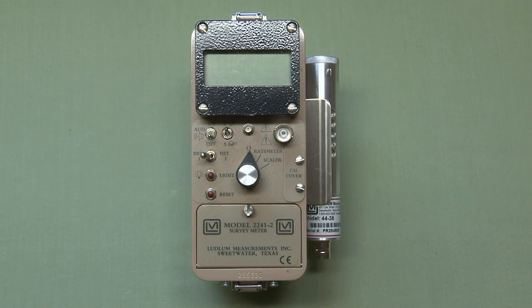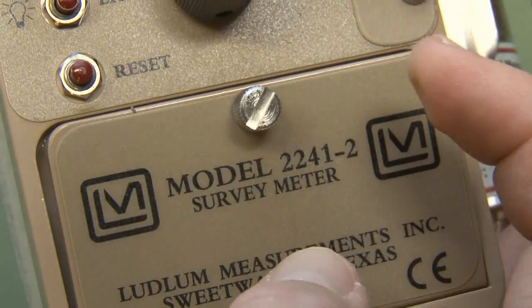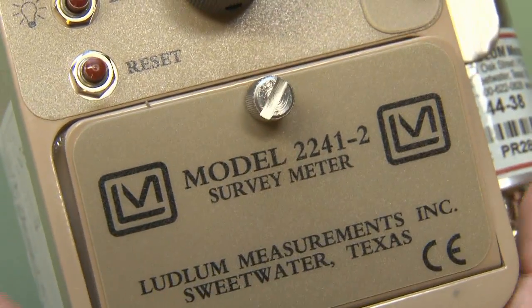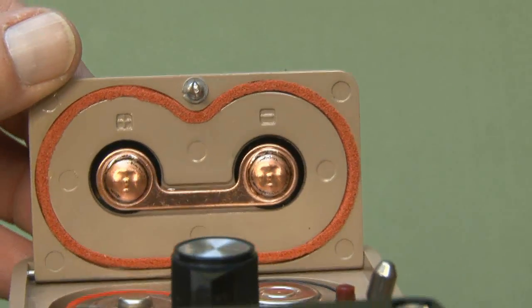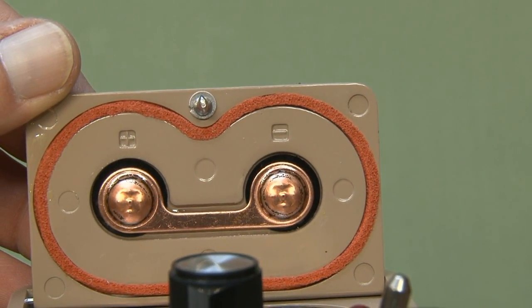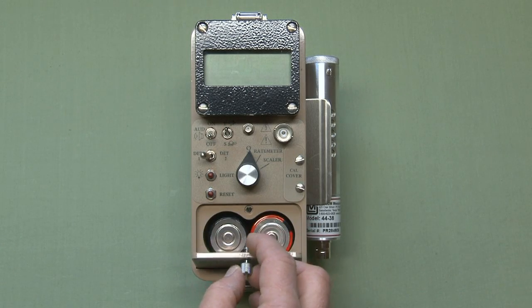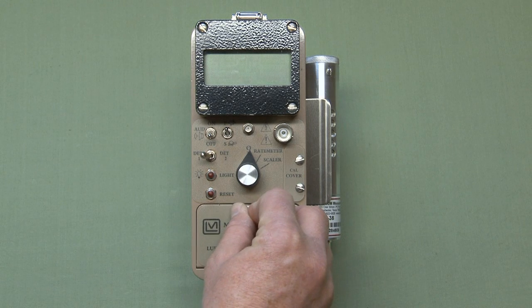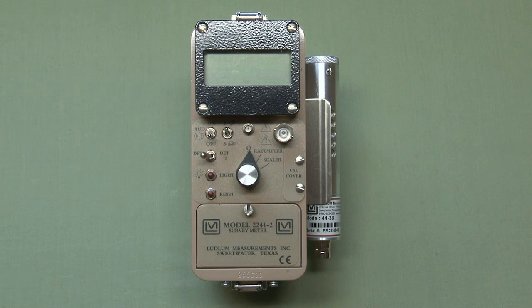This instrument operates on two D-cell batteries accessed by opening the battery compartment door. Turn the thumb screw a quarter turn counterclockwise to open the door. The polarity markings are located inside under the battery door. After installing your batteries, line up the notches, push the door closed, and turn the screw clockwise a quarter turn to lock it. You shouldn't store the instrument for more than 30 days with batteries in place, as battery seal failure could ruin the battery compartment.